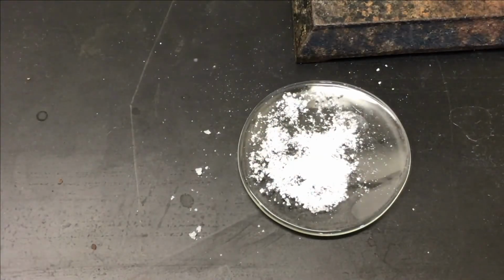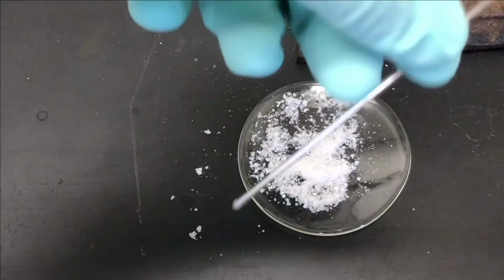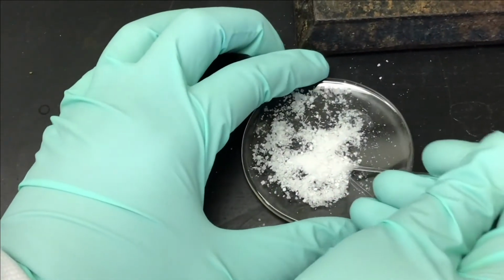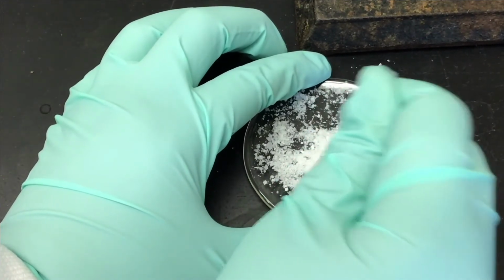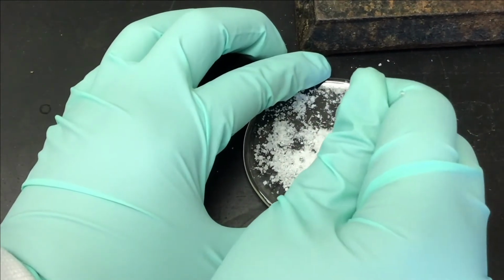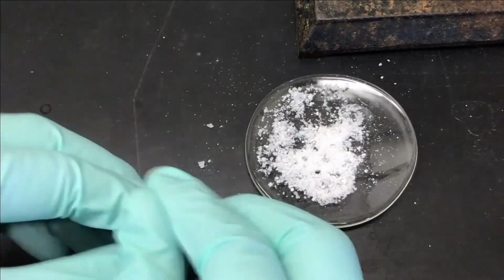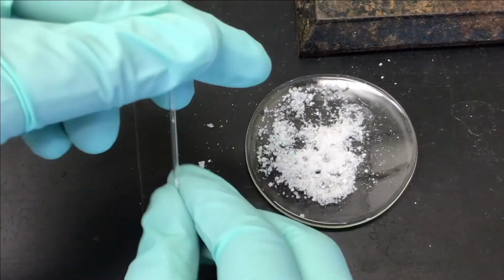Once our crystals are crushed, we're going to use a capillary tube that is closed at one end and open at the other. And then using the capillary open side down, we're going to push it into our crushed solid. This will force our solid crystals into our capillary tube. To get our solid to the bottom of the tube, we gently tap our capillary tube on a surface. Once we have about 5 millimeters of solid in our tube, we can move on to the next step.